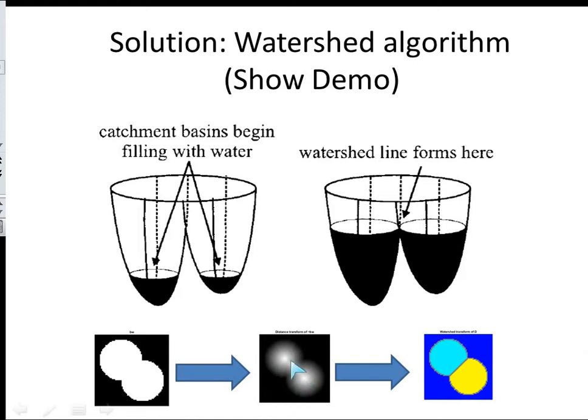With this, you can guess that there must be two objects here, because you can see there are two extremas. This high intensity blob here, high intensity blob here. So basically, you get this information just by knowing this, and then it's two objects. That's watershed.